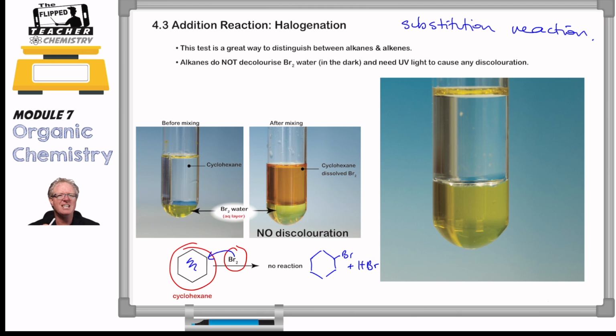And then you would notice that in dark, the alkene will decolorize, the alkane won't decolorize. In UV light, both of them will decolorize, because the alkenes decolorize all the time, but the alkene will decolorize at a faster rate, even in the presence of UV light. So you could use that and add that to make it more valid and reliable. You're testing it under the different conditions, but showing that the double bond and single bond also have a difference in their reactivity.